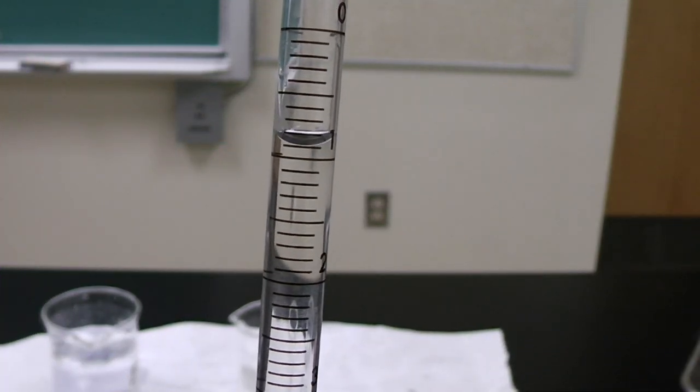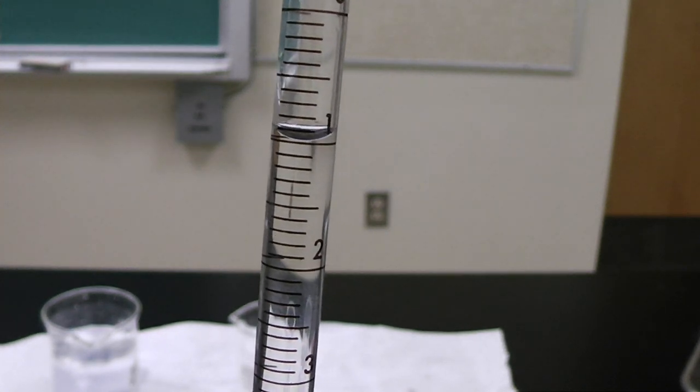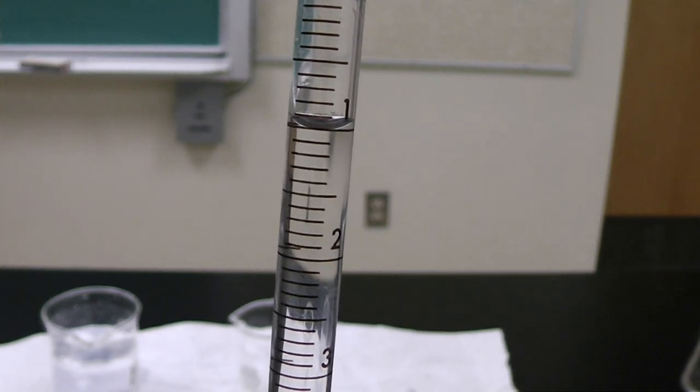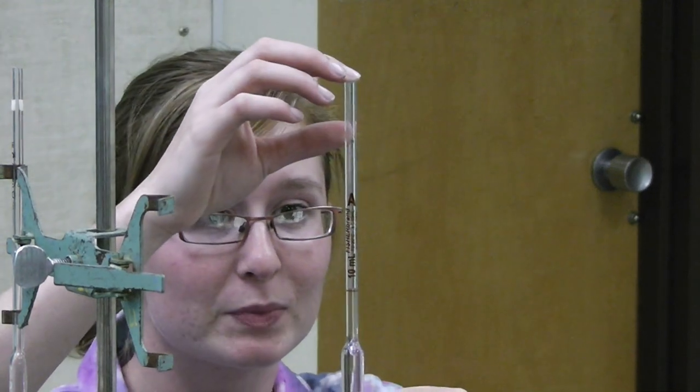One method to only dispense a small amount of liquid is, with your finger on the top, slowly rotate the pipette until the liquid drops down to the desired mark, as shown here. When taking readings, always make sure that you get to eye level to read the meniscus.